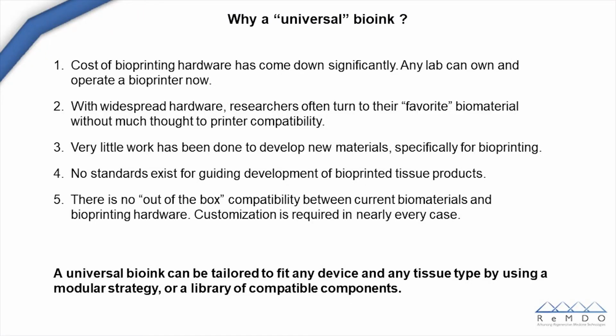And so why develop a modular tunable bioink system or a universal bioink? There's many reasons, but here are about 5 just to get started. So the cost of bioprinting hardware has come down significantly, and any lab can own and operate a bioprinter now. With widespread hardware, researchers often turn to their favorite biomaterials without much thought to printer compatibility. There's also been very little work to develop new materials specifically for bioprinting.